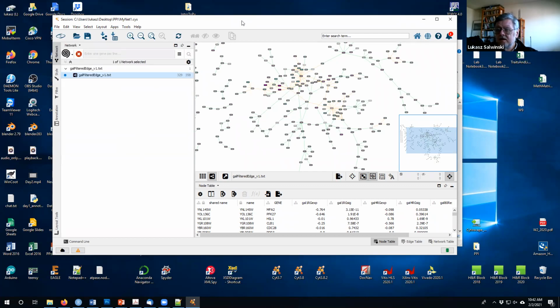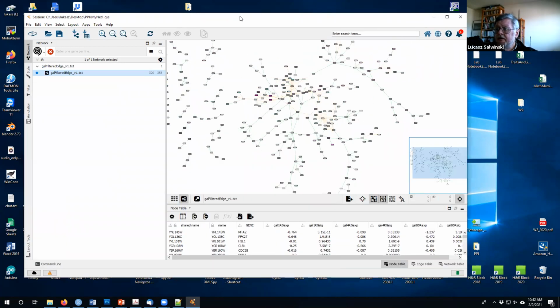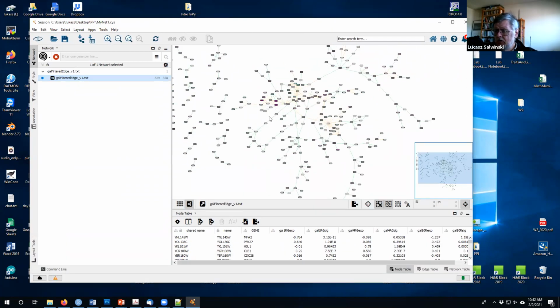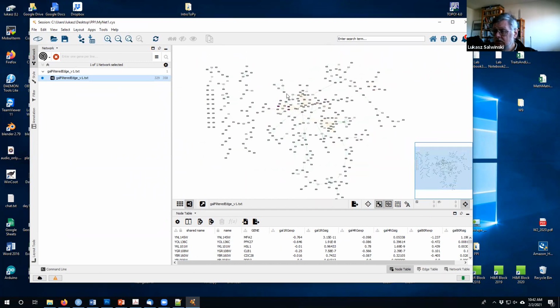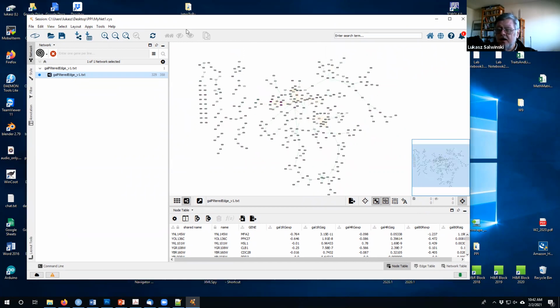So that's what we've got here. As an example of dealing with plugins, we can try the one that I asked you to install. This is the BiNGO one here.